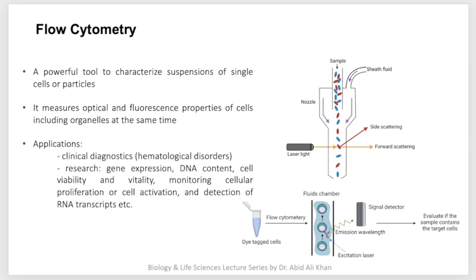Why is flow cytometry used instead of the conventional microbiological or molecular biological methods? The reason is it's cost effective, it's way faster, a rapid analysis, and last but not least, it's efficient and accurate, because any cell or any particle that is in the sample has to go through in front of the laser, and if it goes through the laser, it cannot hide from the laser.